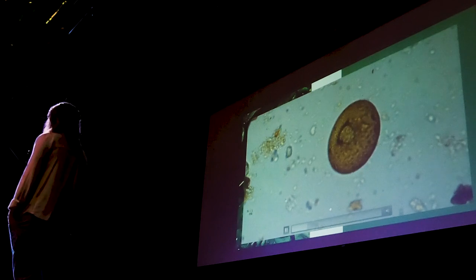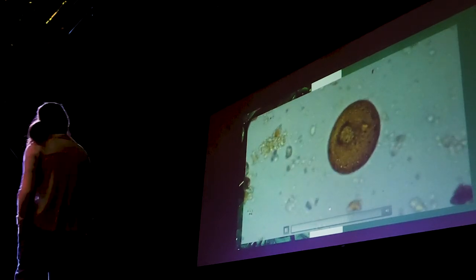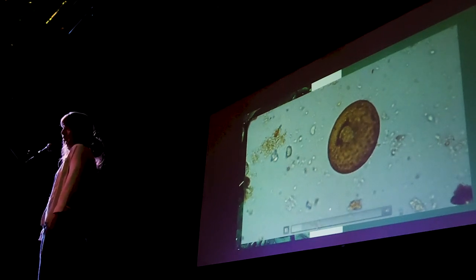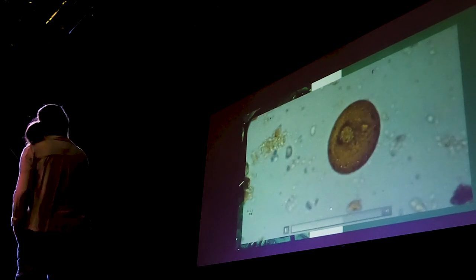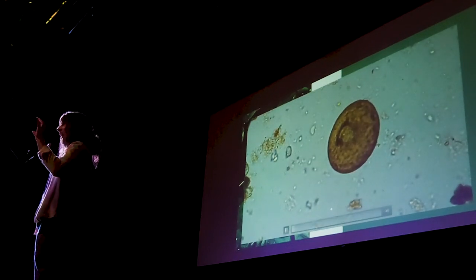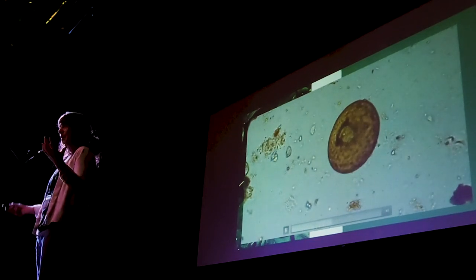This is another variety of testate amoeba. So they come in all shapes and sizes. This is called Arcella. Arcella are typically living in forest systems, and I think they're quite beautiful. They're really round, and as time goes on, they get darker and darker and darker. Like I said, they build that shell.